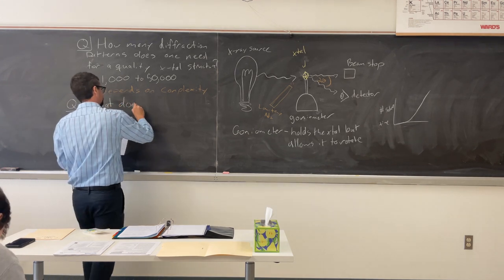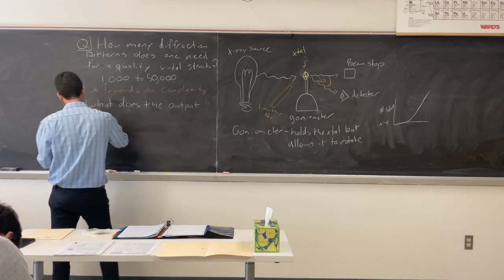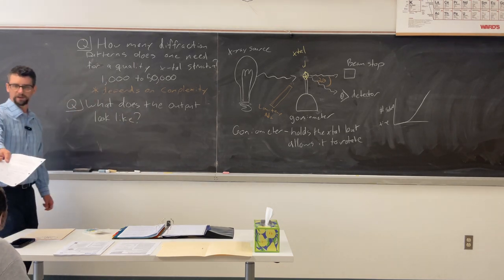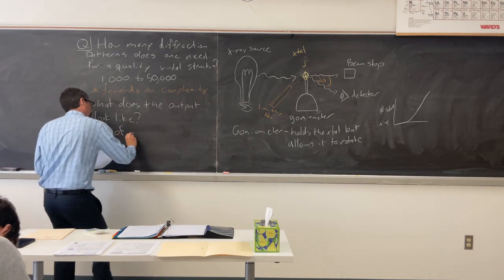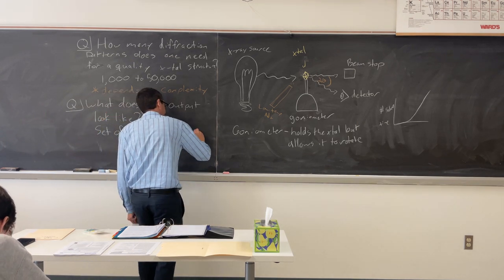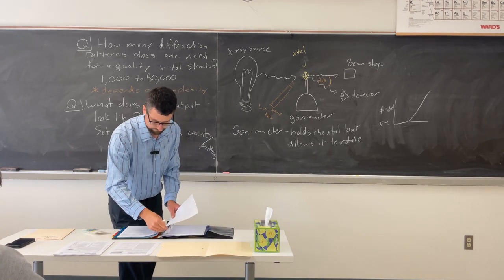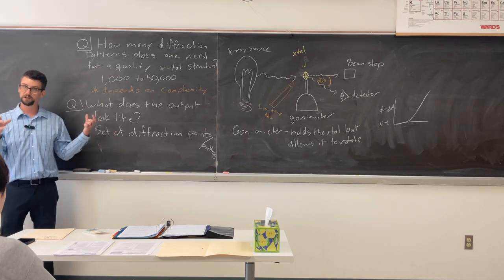What does the output look like? So the true output is a set of diffraction patterns. And that gets assembled from collecting all the different reflections and doing some math.